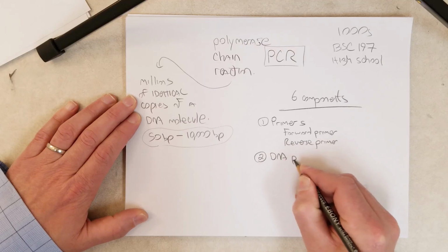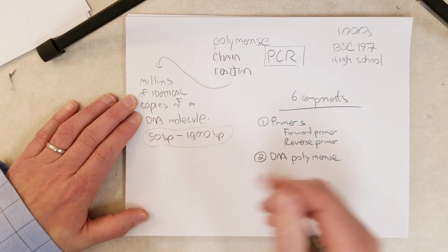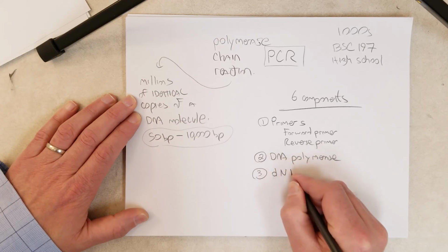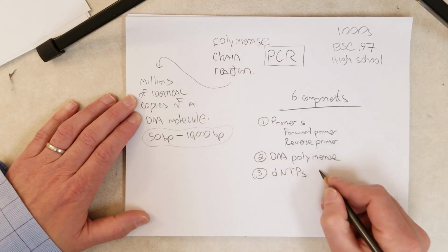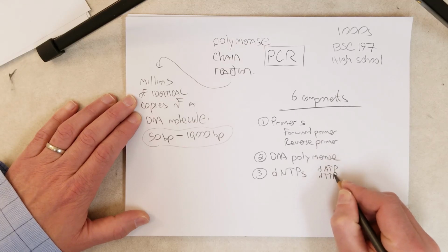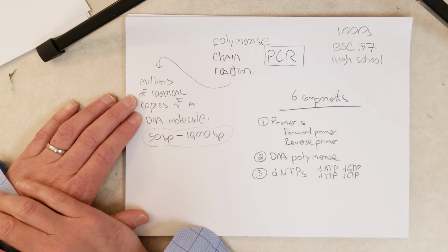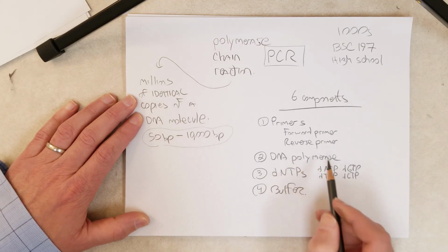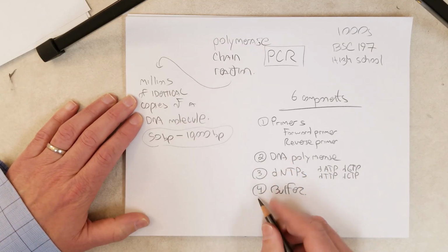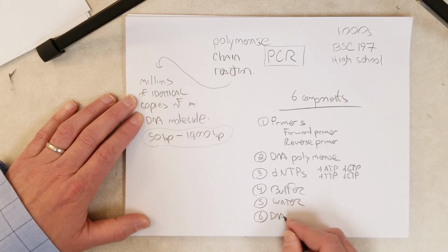And so let's go with number two, DNA polymerase. And this is a special polymerase that works well at high temperatures. I'll talk more about that in a moment. So we need dNTPs. In the last video, we talked about ddNTPs. But no, for this, we just need deoxyribonucleotides. So dATP, dTTP, dGTP, and dCTP. So the D is for deoxy, because we need DNA nucleotides, not RNA nucleotides. We need buffer because the DNA polymerase doesn't like working in water alone. It needs some salts in order to work effectively. We need water and we need the DNA to be copied. We're going to call that the DNA template.